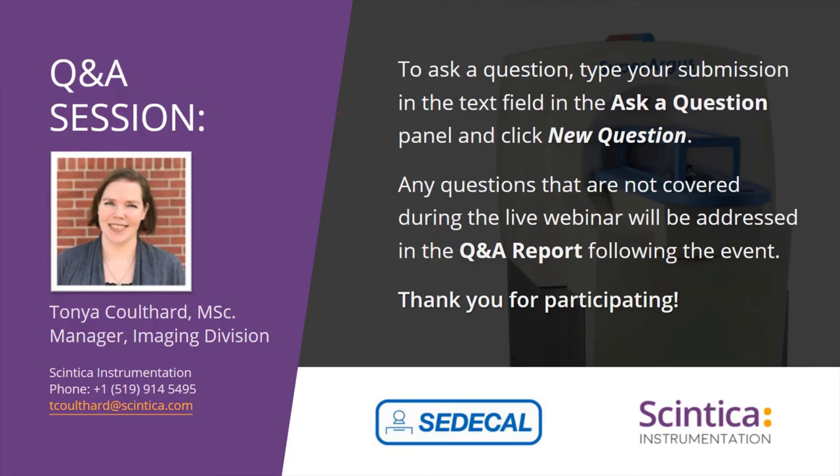So if there's different isotopes that you want to use as you're setting up some unique tracers within your lab, please just reach out and we'll be able to confirm that those agents are possible to use with the SuperArgus system. Okay, perfect. And actually, here's another question about radio tracers.